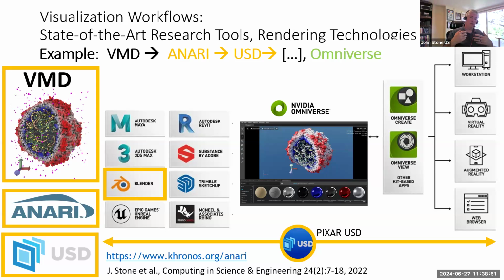So these can be tools where you sketch things in 3D. It might also be good for creating illustrations. VMD's strength is to visualize the atomic structure and the understanding and analytical tools that it provides, but it's not really meant as a sketching tool like you would use in a more artistic program. And that's where there's an opportunity to connect to some of these other things. So this allows us to take VMD's geometry and directly use the rendering and features of other tools like Blender and Omniverse. Since I work at NVIDIA, NVIDIA's Omniverse goes in a little broader direction.